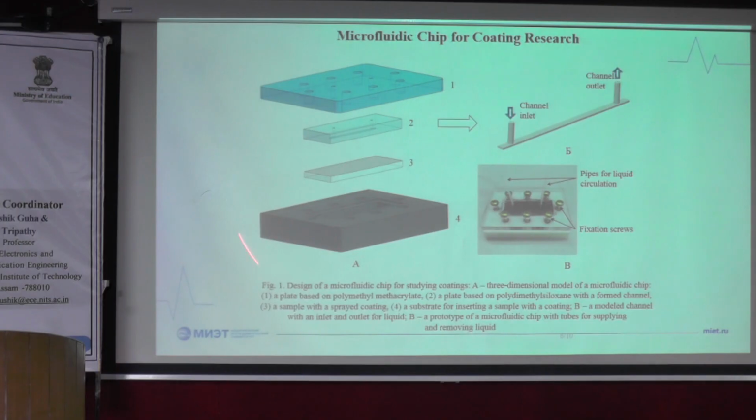And this microchip can be potentially upgraded for the microfluidic system that can be used for an implantable artificial kidney device. So basically this particular microfluidic chip was of course made in terms of the test for artificial heart, but the basis of this technology can be further developed for the microfluid chips that can be worked for organ-on-chip manufacturing for implantable artificial kidney.